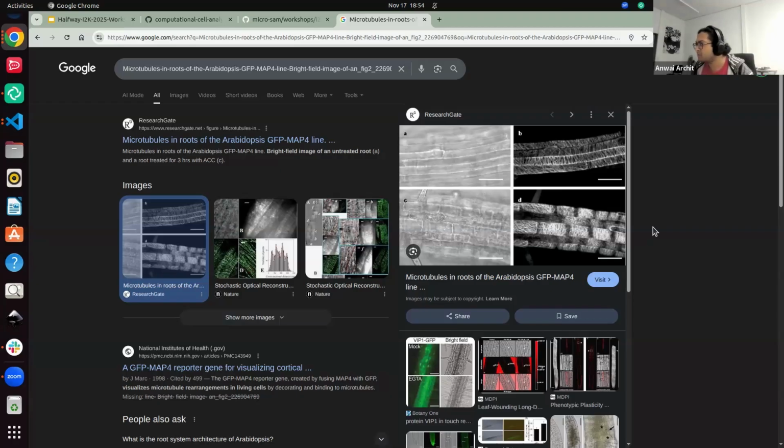If you're interested in microtubules, you might have to retrain a model, but that would be the direction to go. Just see if cell identification is your task. If you want to go further, let me read your question. But the plant cell images, yeah. So cell identification is your task. It should be interesting to check out. I would say it should work and do an okay job. But it'll be interesting to see how it does on these bright field images.